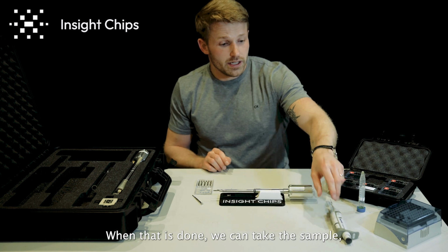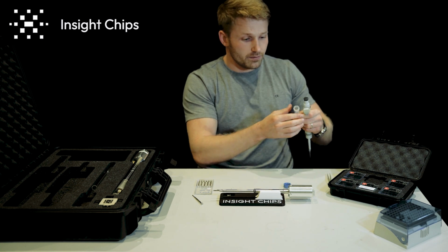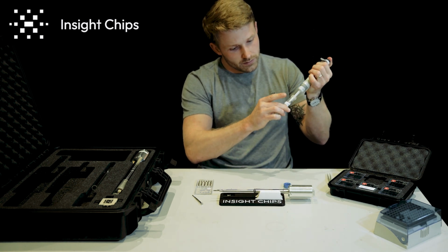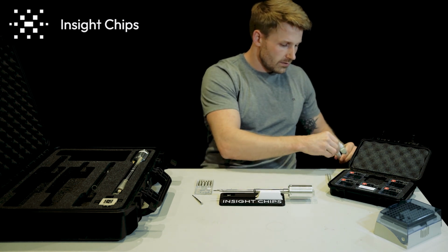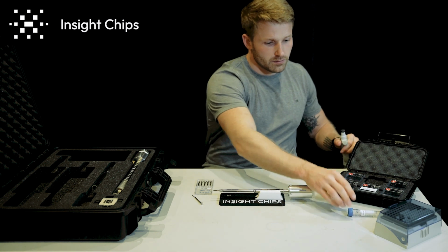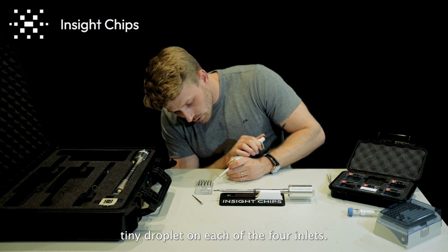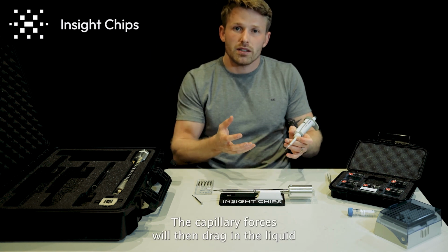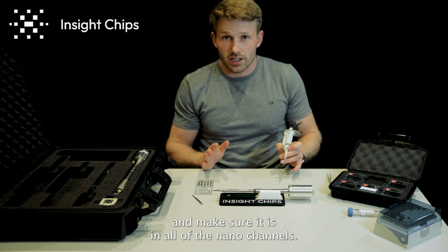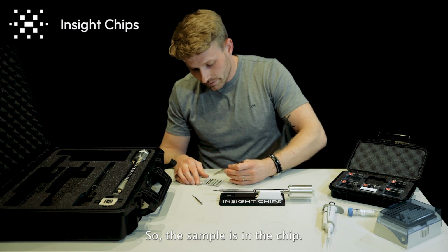When that is done, we can take the sample, and just a microliter or so will be more than enough. And then by depositing just a tiny, tiny droplet on each of the 4 inlets, the capillary forces will then drag in the liquid and make sure it is in all of the nanochannels. So the sample is in the chip.